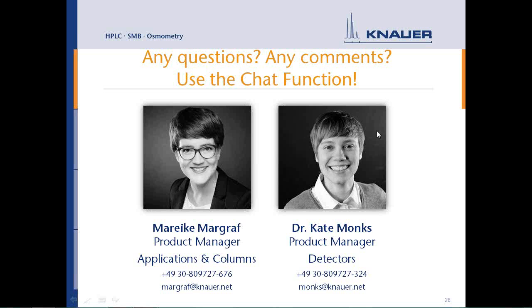But I think what you can really keep in mind is, if you've got trace analysis, use the high sensitivity light guide. If you're looking at high resolution, high throughput applications, you need to use the standard light guide flow cell. If you've got standard applications, you can use the standard cartridge. And if you've got semi-prep applications, you can use the 3mm and 2 microliter flow cell.